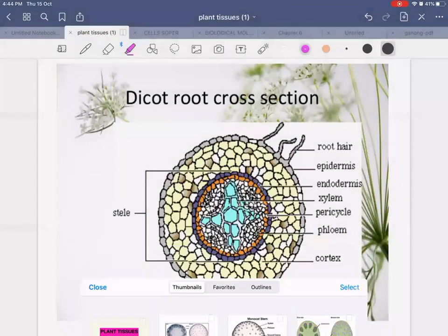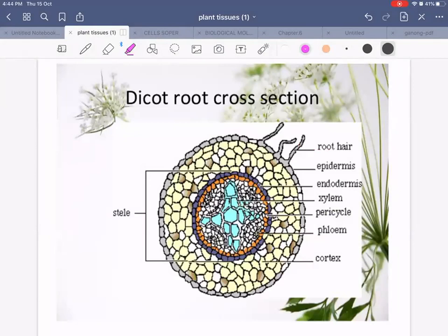Okay, this is the slide of a dicot root. Let's say you are given this slide and you are asked to draw a low power plan diagram. I start drawing with a sharpened pencil like this. Now I can see in this diagram that the cortex of the root is occupying roughly this much space and the central part is occupying this much space.